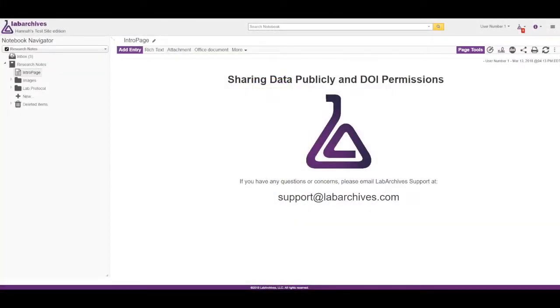This video will cover sharing data publicly in LabArchives. You can share data publicly by using a share URL or by creating a DOI. Your institution may prevent you from sharing data publicly or they may use DOI permissions.